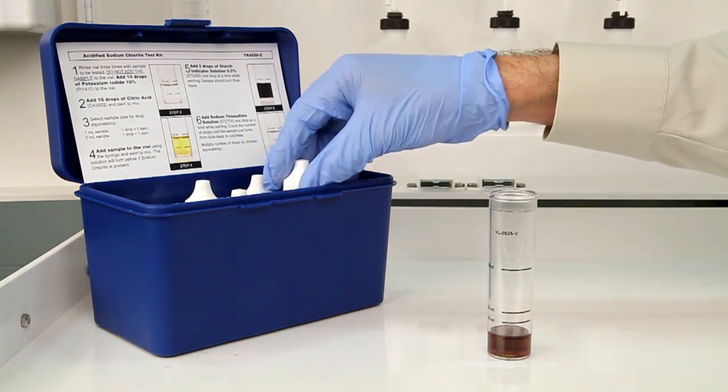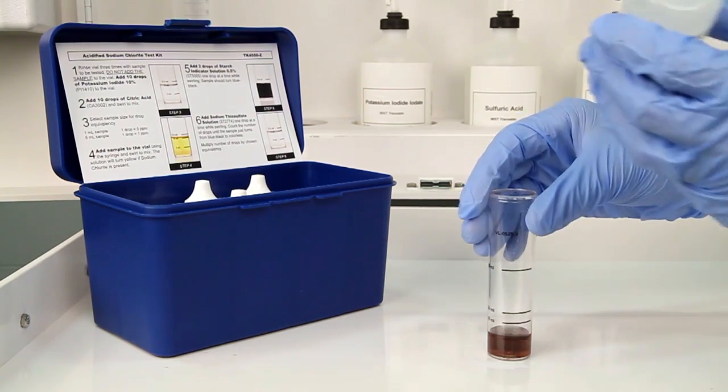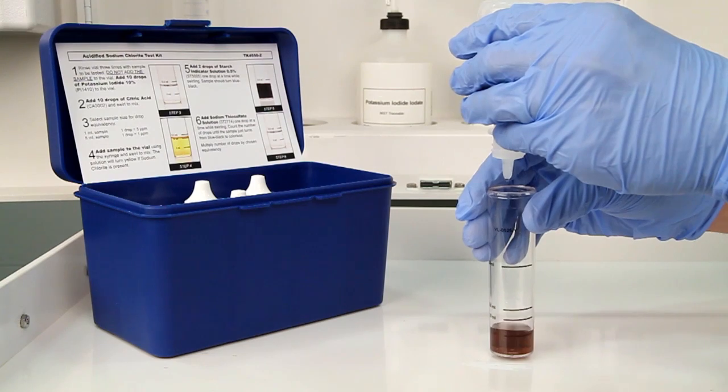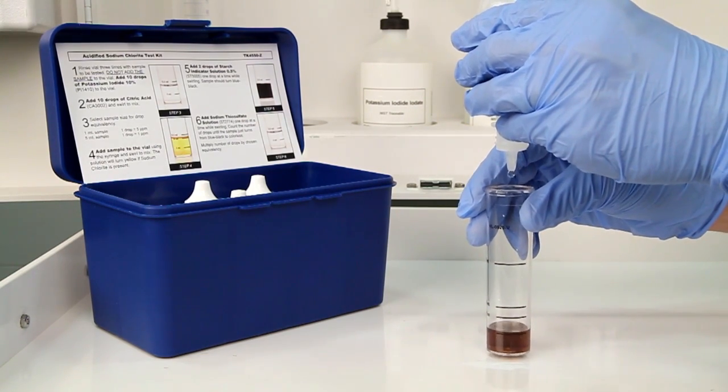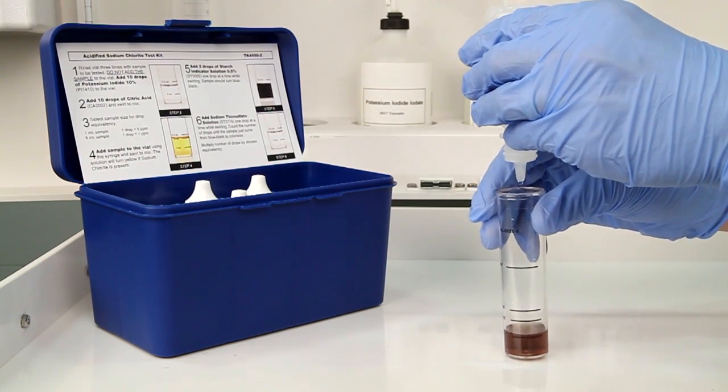The next step is to perform the titration using sodium thiosulfate solution. Each bottle of titrant is labeled with the equivalency and sample size it was manufactured for. It's important to make sure you have the proper titrant and the proper sample size for this titration.